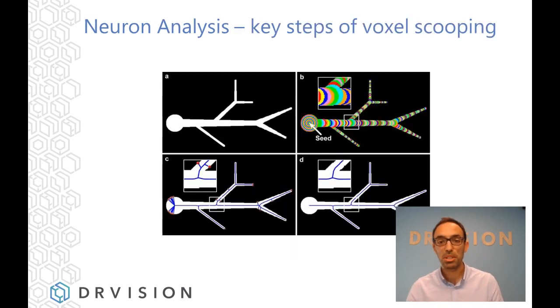I wanted to mention a little bit about the algorithm that we're using, because this is for the tracing of the dendrites. This is probably the most important part of any workflow, the type of algorithm that you use. This particular one is from 2009, and we find that it is extremely robust at detecting dendrites in 3D space.